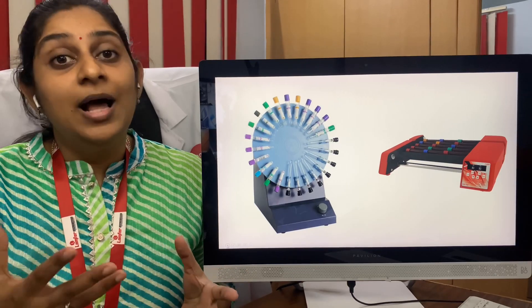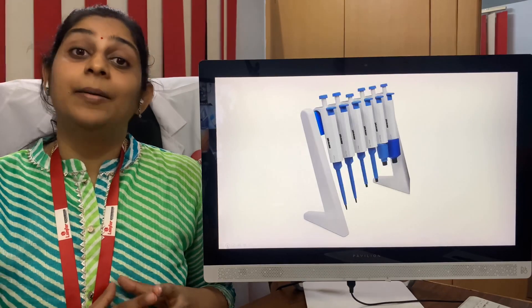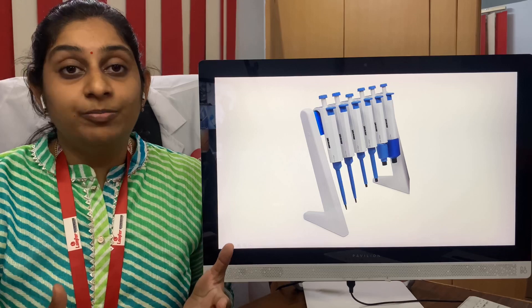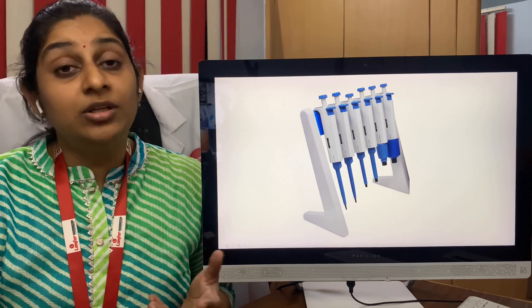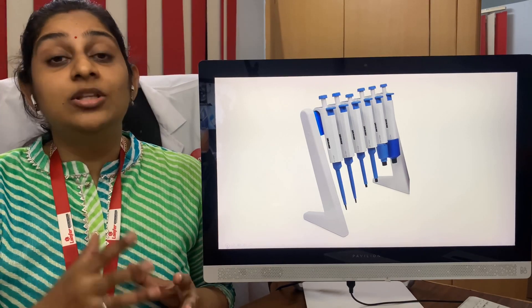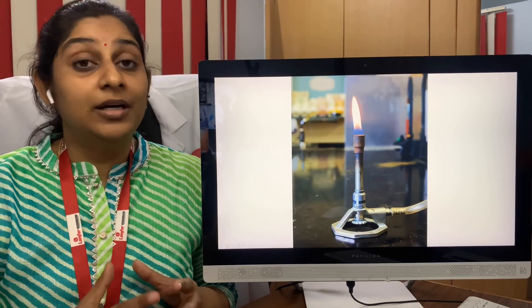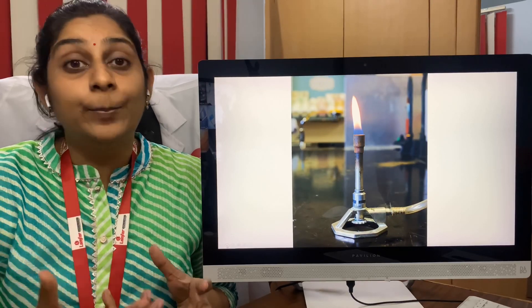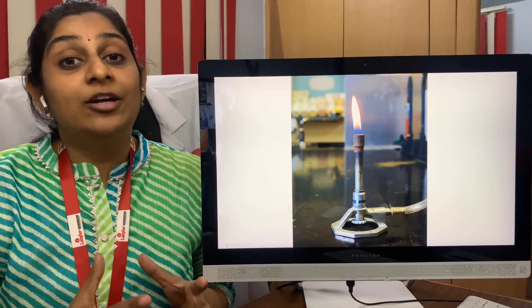Next comes the pipettes. There are various types of pipettes for measuring the volume of reagents and samples, which is very important in biochemical tests. After that is the Bunsen burner. The Bunsen burner is important mainly for microbiology, where you need to streak all the samples onto the plate.